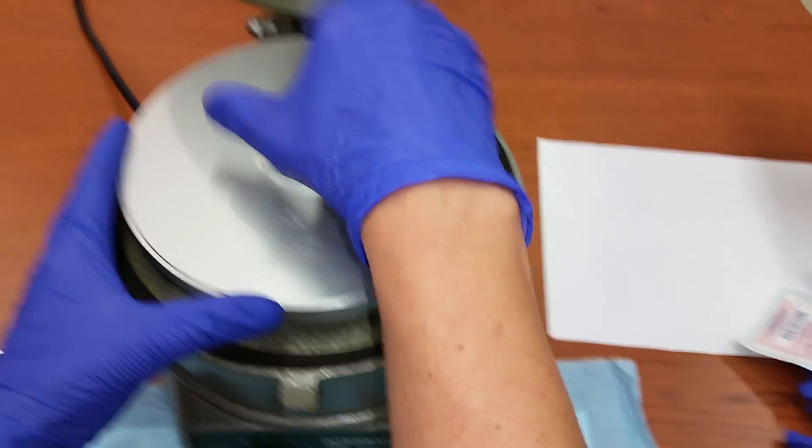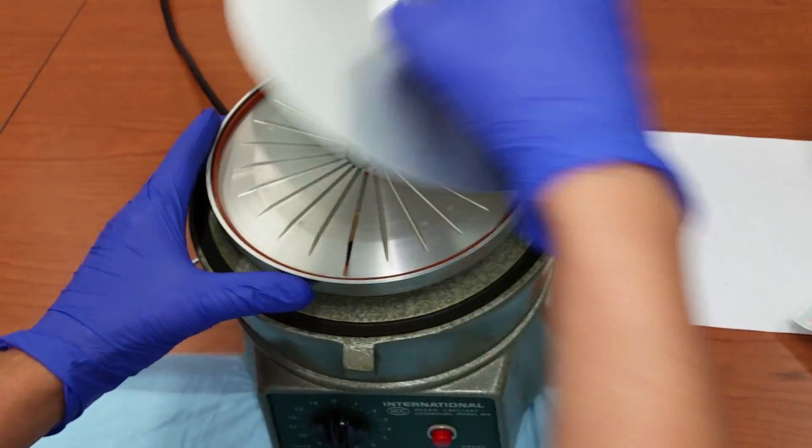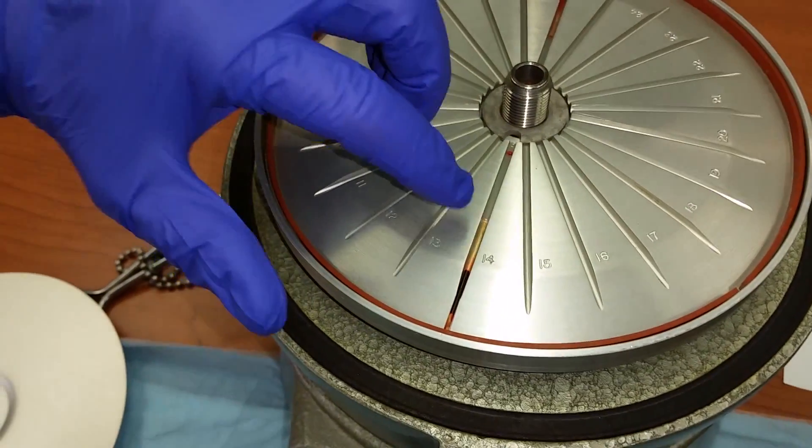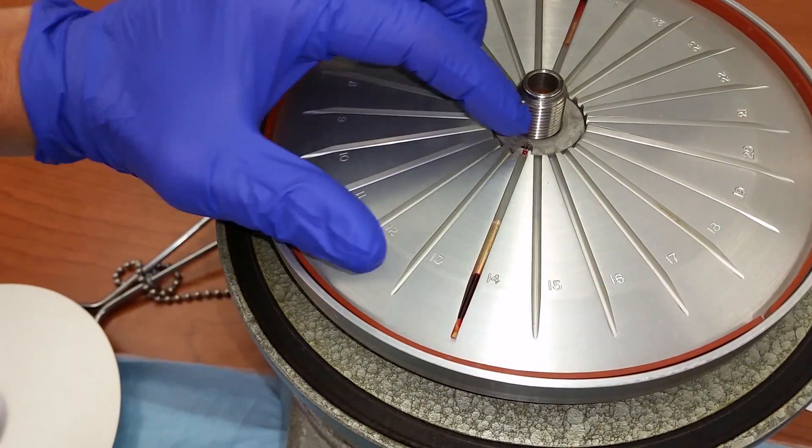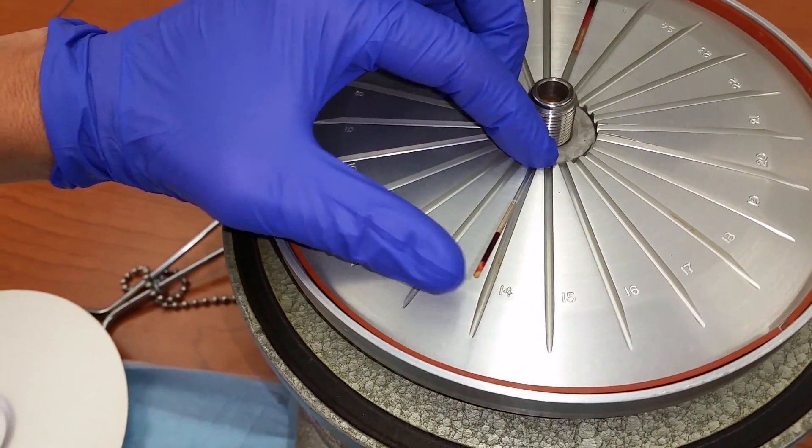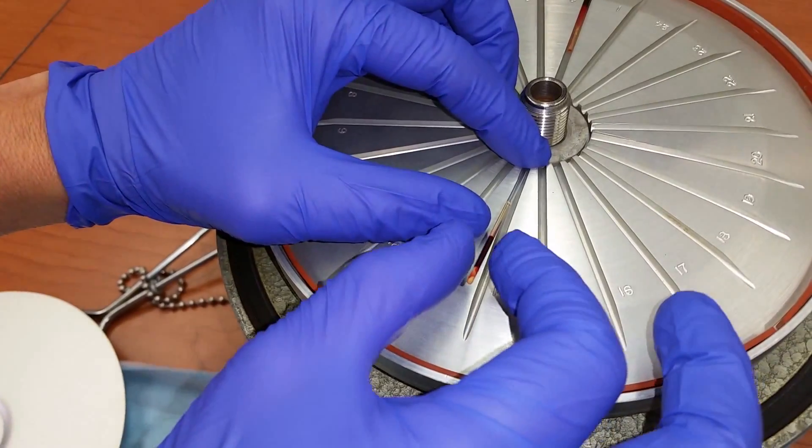Remove the cover. To remove the capillary tube, slide it towards the middle of the centrifuge, put some pressure on the top and the bottom part will pop up.